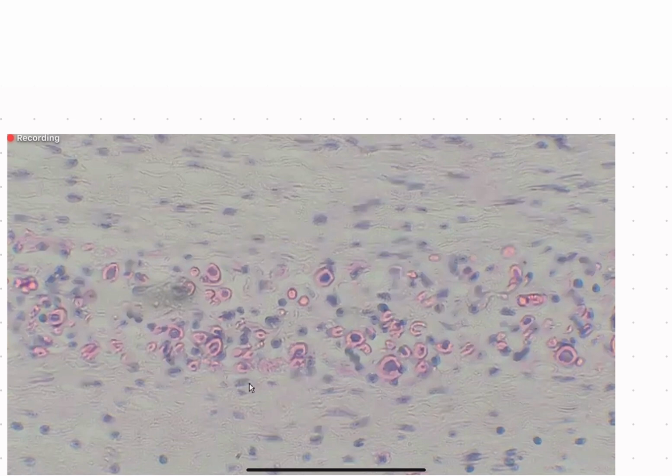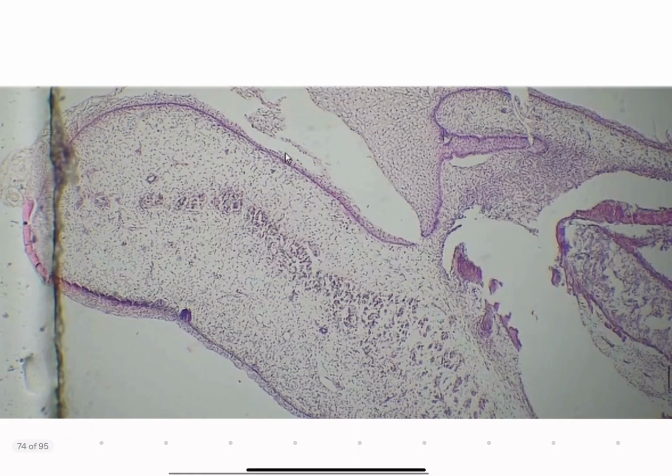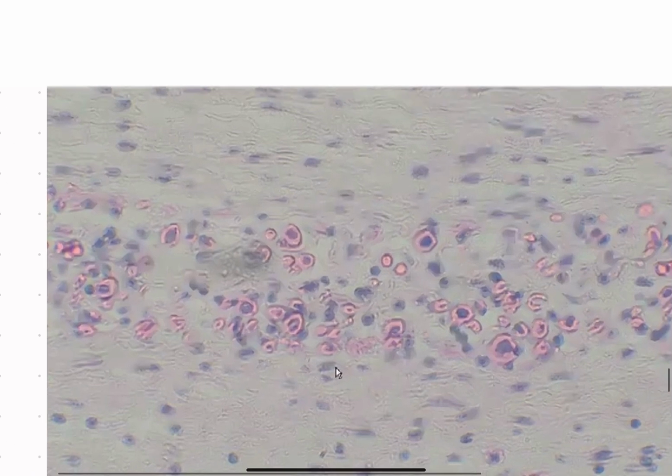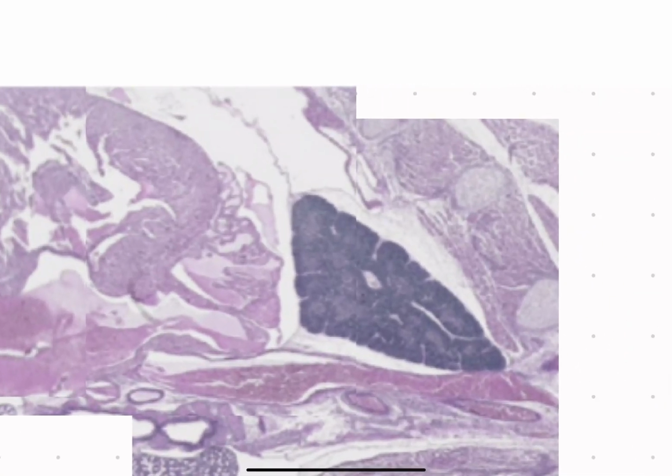If we had zoomed out, it would be this structure. But because we zoomed in, it's now this. Right? Carrying on, we see something like this.